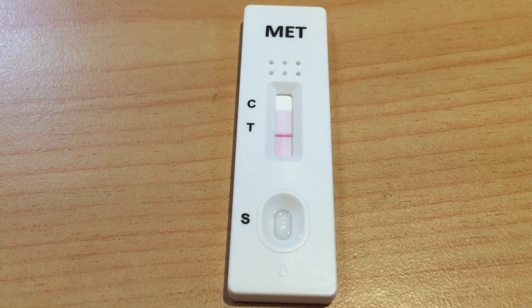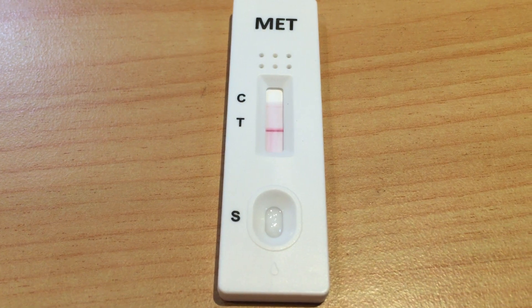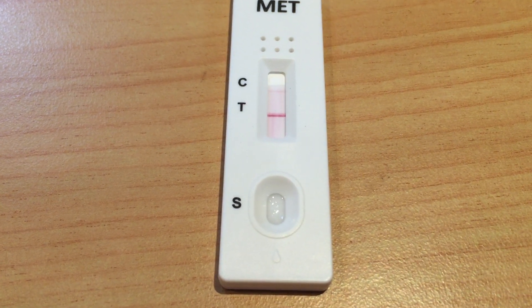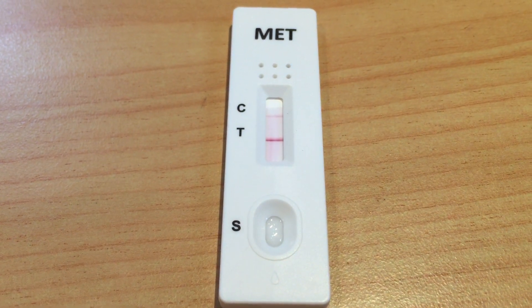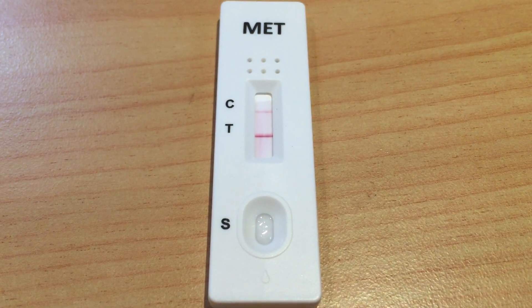Yeah, it's definitely a negative one compared to the other one we tested. The intensity of the line on the T also tells you how heavy the meth residue is. This video is pretty much just showing you what a negative result should look like — no meth contamination.